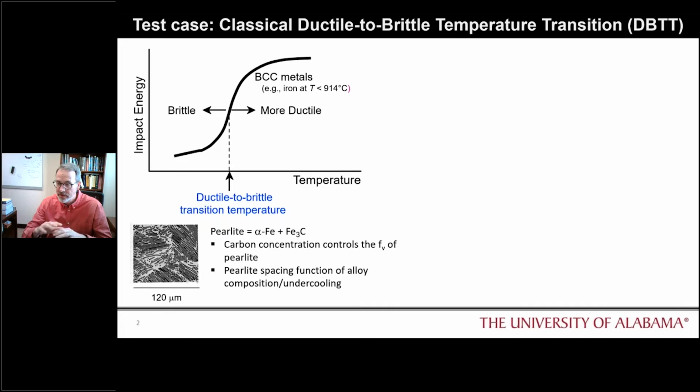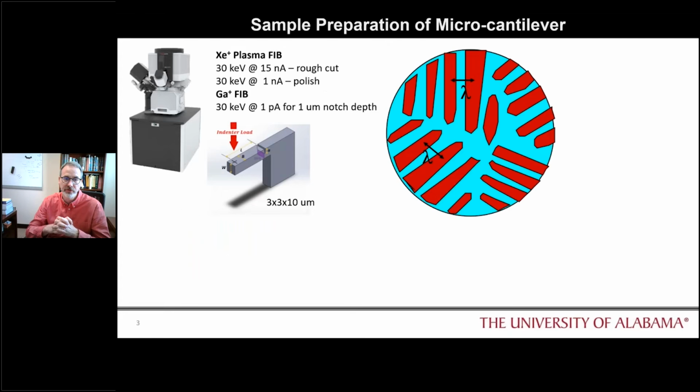If we look generally at the microstructures of our two samples, our 1095 steel and our gray cast iron, we see that the spacings are roughly the same, slightly larger for the ferrite structure in the 1095 because it has a lower carbon content. Based on that spacing, the total number of laths that we could capture within our beam is roughly approximated in this table below.